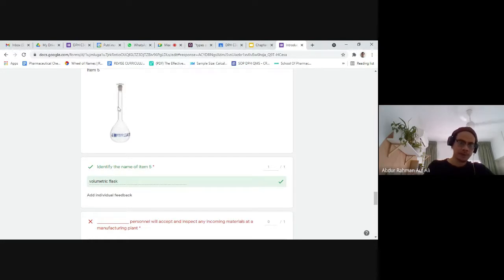So kalau kita nak prepare a certain 250 milliliter, kita masukkan that solution sampailah that one line. Okay, kita tak boleh prepare 200 milliliter solution dekat dalam bekas ni. Okay, because ini hanya untuk solution sebanyak 250 sahaja. Kalau nak prepare 200 milliliter, you choose a 200 milliliter volumetric flask. Okay, the specific volume sahaja, isi padu yang tertentu sahaja. It is written on the flask. Kamu kena tengoklah, what's the reading.